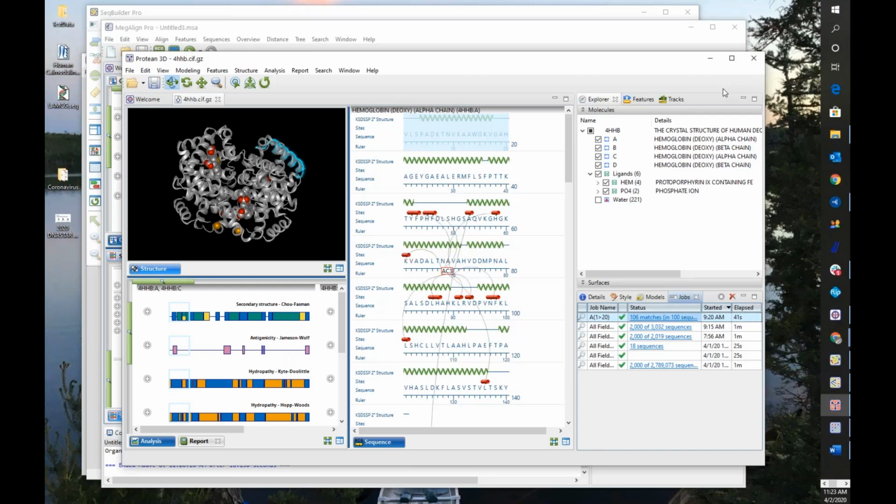We don't have a one-button solution that would support methylation data, but there are some workflows where you can potentially identify those areas in our various applications where you can look for mutations and find similar regions of interest where methylation could potentially occur. But the answer to your question is, not in SeqBuilder Pro, but there are some workflows where you can potentially get to the answer. So we'd recommend that this customer contact support so that somebody can show the different alternative applications where that could be studied, correct?